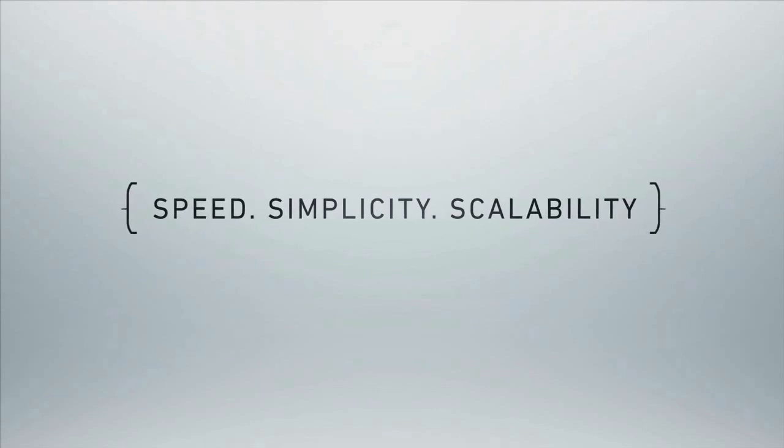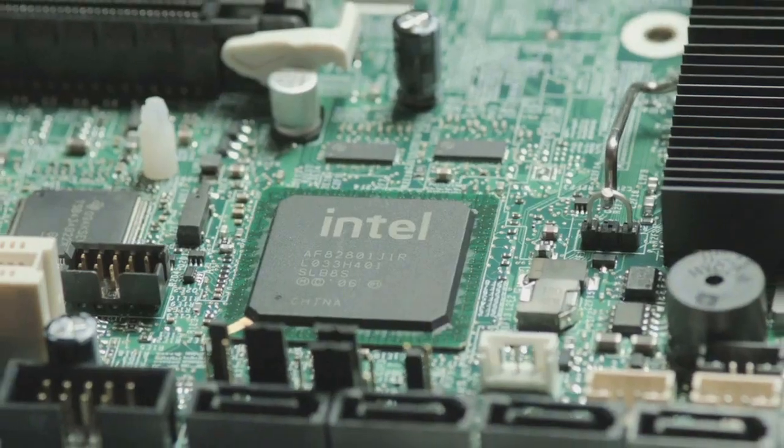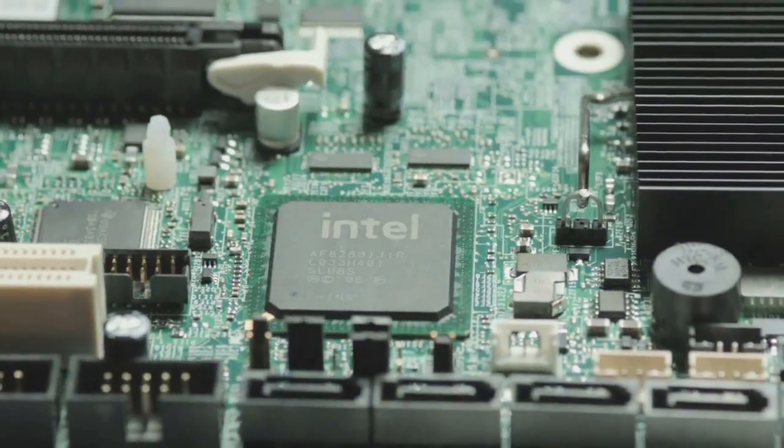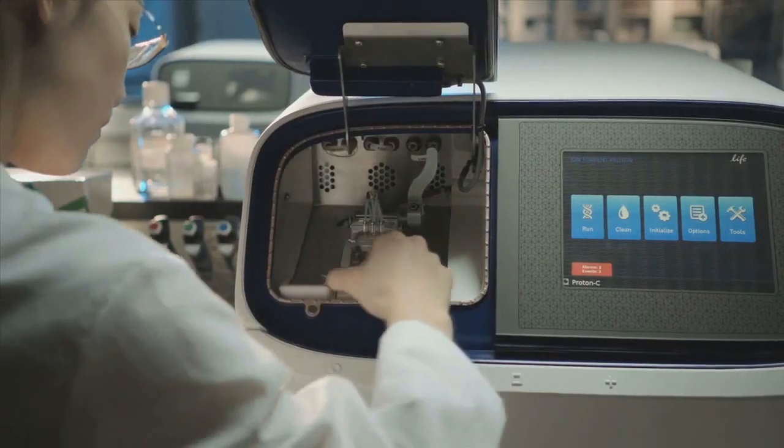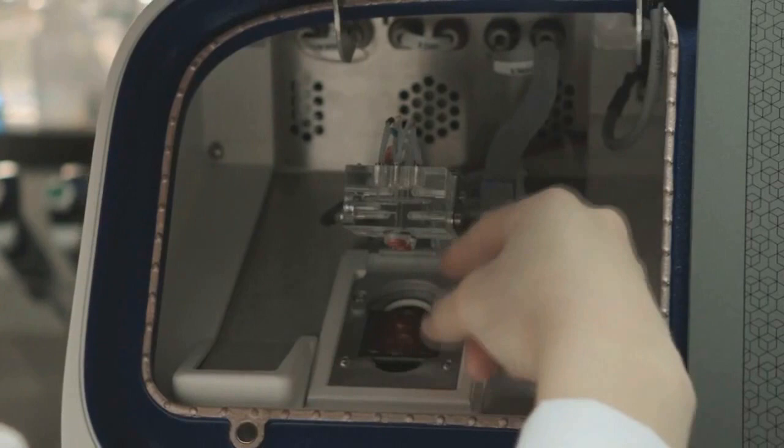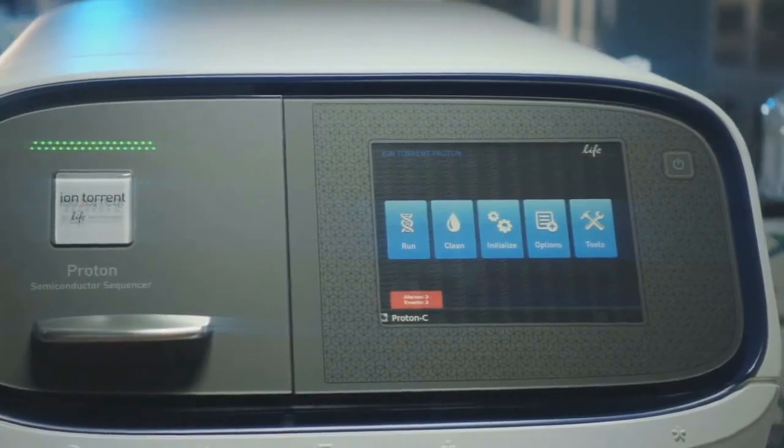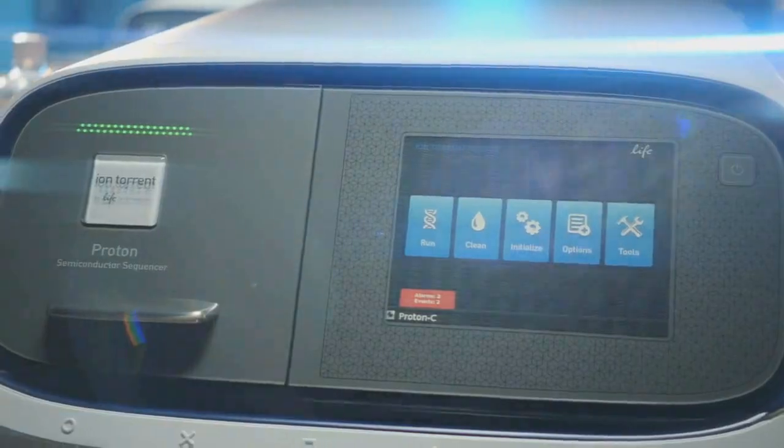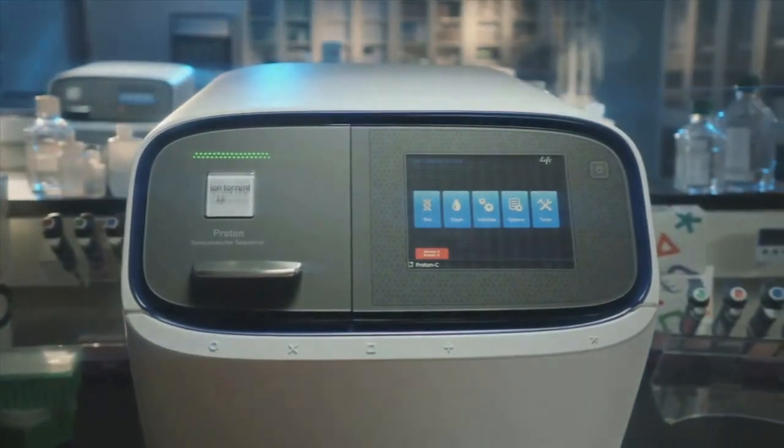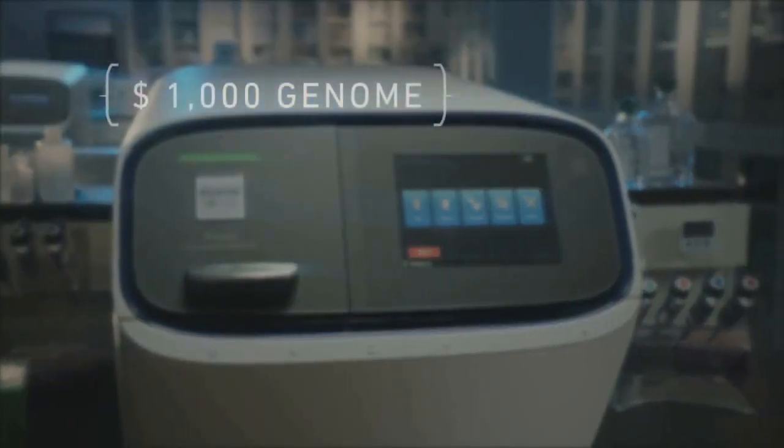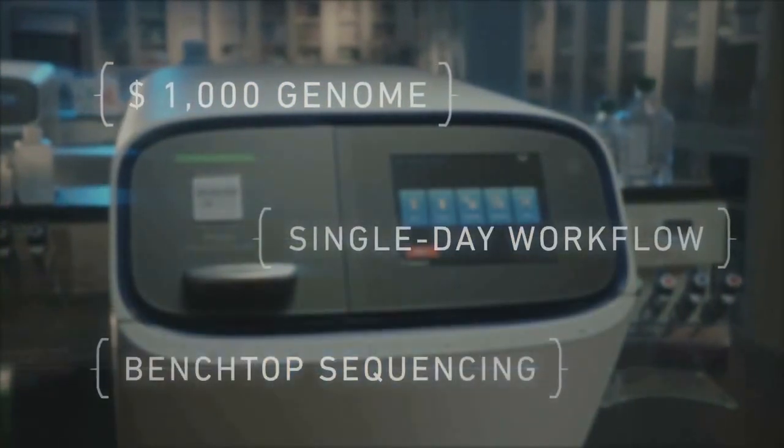One of the big challenges going from the PGM platform to the Proton platform was just dealing with a thousand-fold increase in data. We've been able to do that by leveraging the latest generation hardware from Intel and others, using more cores packed into the instrument itself. We've moved more processing off the instrument and onto the ion chip itself, and we're leveraging the latest in hardware coprocessors to make sure that we're able to quickly process that data and distill it into just the most relevant biological information. All of those things together combine to create a thousand-dollar genome in less than a day on a simple benchtop sequencer.